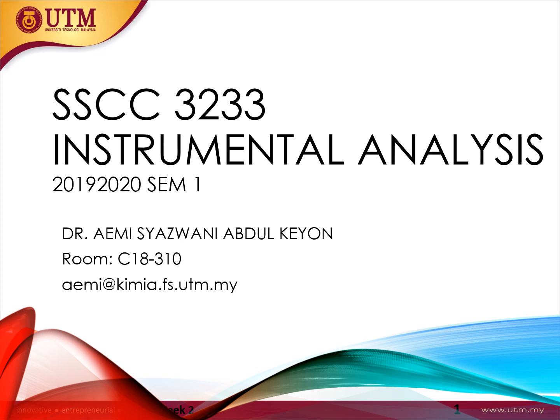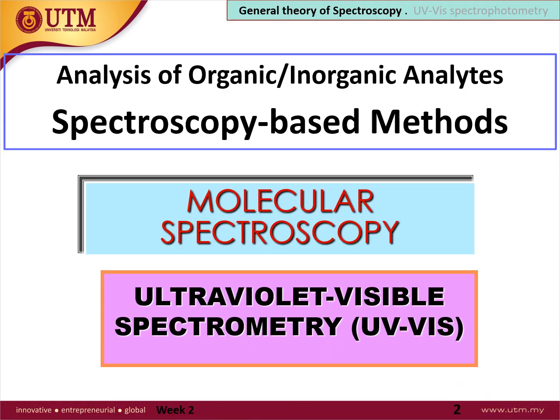How are you today? We are here in our second topic, still in the subject Instrumental Analysis. Our second topic is about the analysis of samples using ultraviolet visible spectrometry.